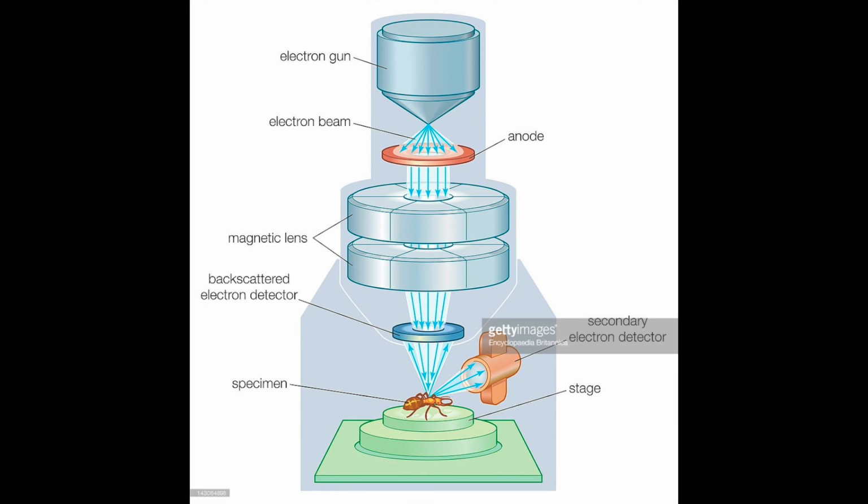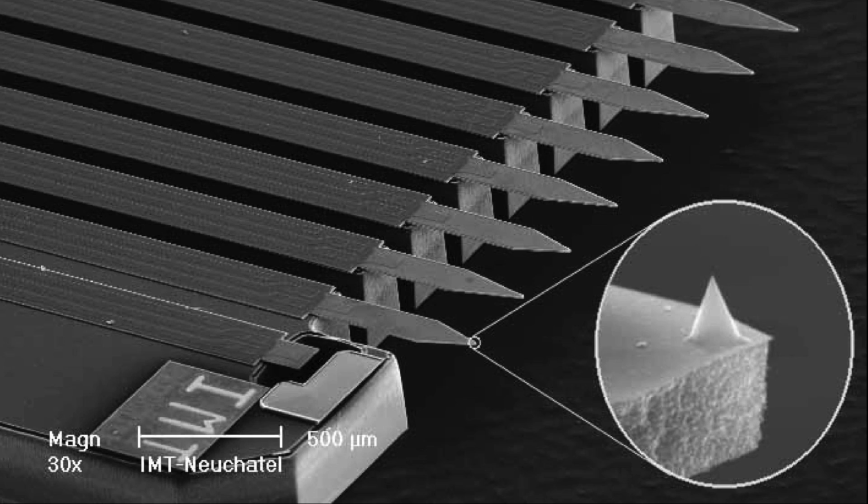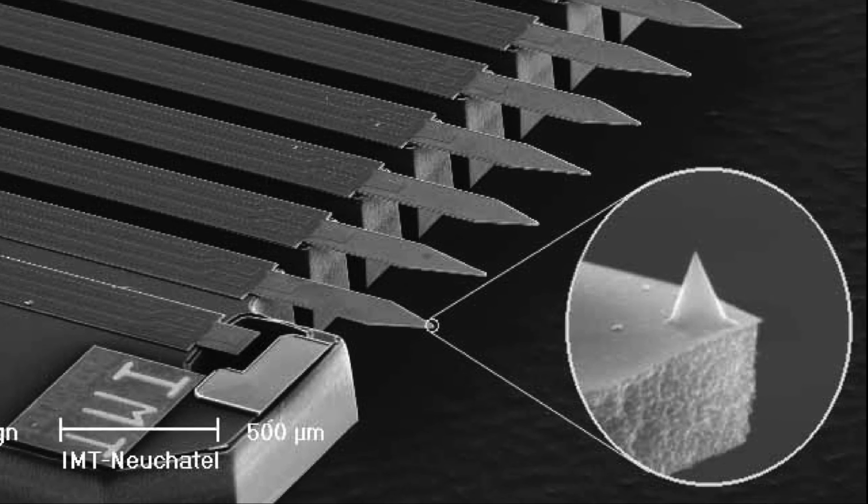composition. The electron beam is scanned in a special pattern used to code for visual displays, and then the beam's position is combined with the detected signal to produce an image. SEM can achieve a resolution better than 1 nanometer.